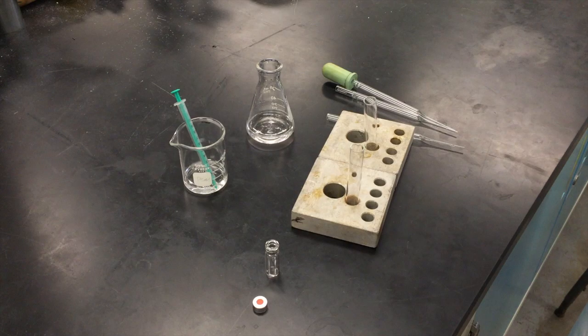Prepare for this by rinsing two small test tubes with one milliliter of diethyl ether. Then syringe one milliliter of diethyl ether into each of the two rinse test tubes.